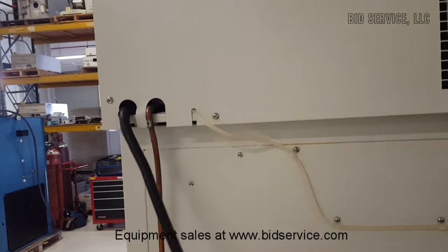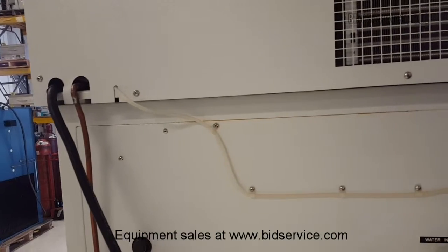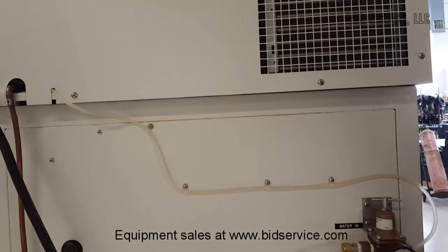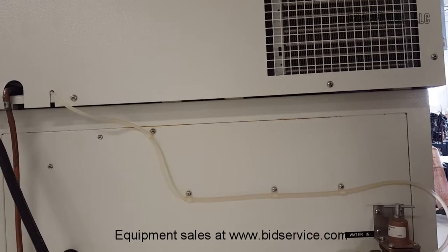Here's your power line going in. This requires 208 single phase with a neutral to give you the 115 volts. So it's actually four wires — two phases, a neutral, and a ground.